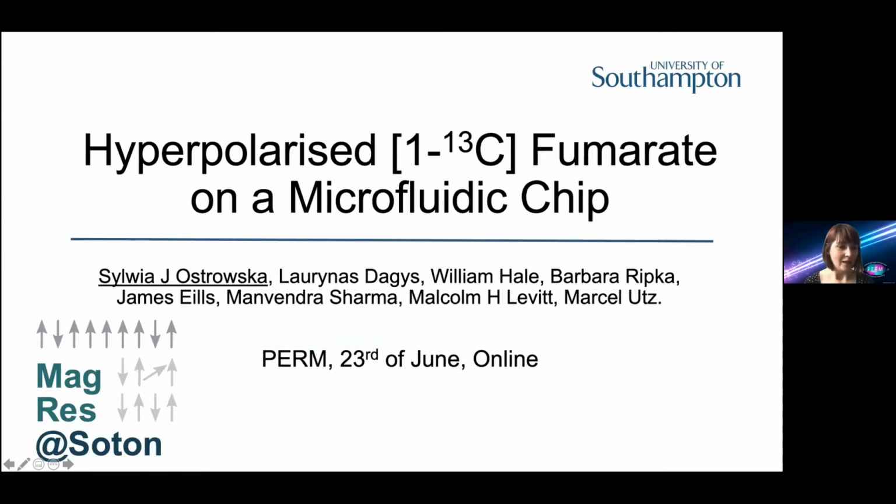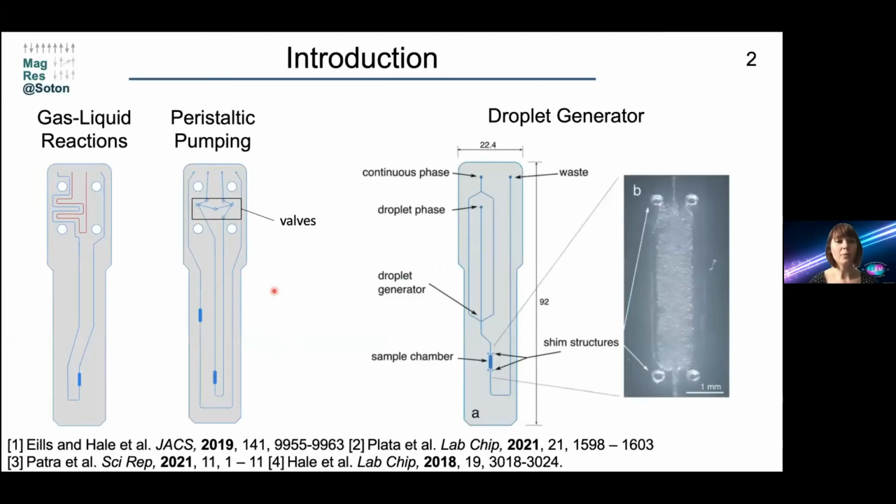Thank you very much for inviting me here to present our research. Our motivation behind this work is to produce a hyperpolarized metabolite by PHIP at a microscale. Our group in general specializes in performing chemical reactions and biological cell culture at microscale.